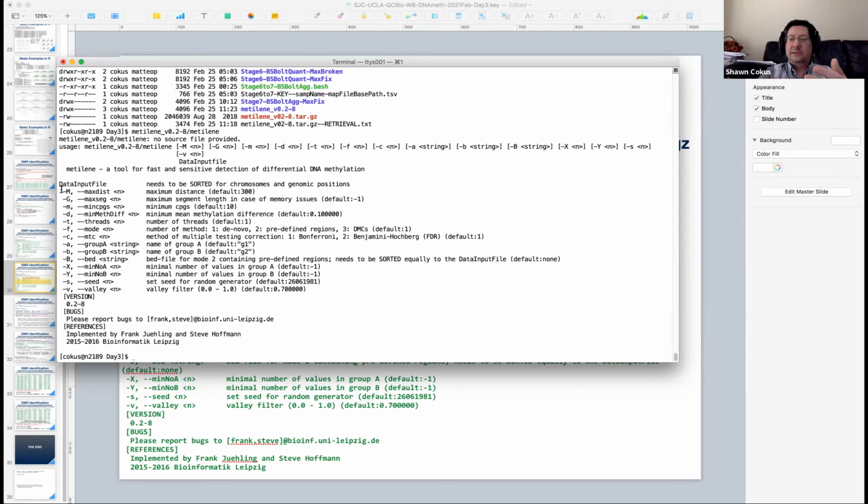The output is going to be a list of the regions that pass the statistical test, the optimized regions that pass the statistical test. So it's going to be chromosome, start coordinate, end coordinate, some kind of p-values, and maybe an FDR adjusted q-value, false discovery rate adjusted. We're going to have the actual mean difference between the groups, right? Strength of effect. Statistical significance is one thing.